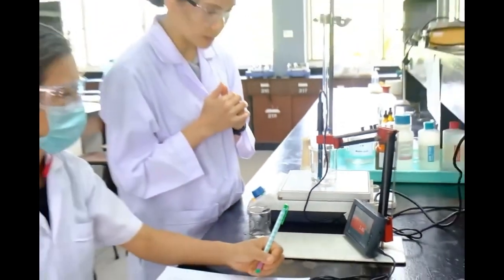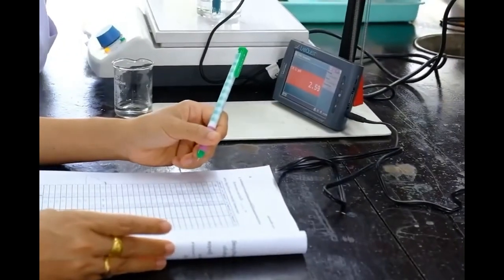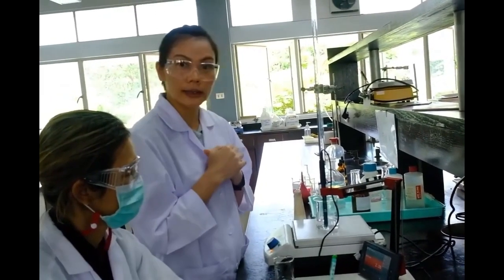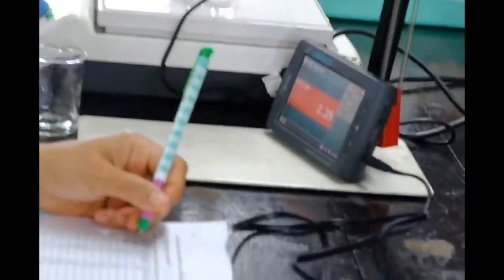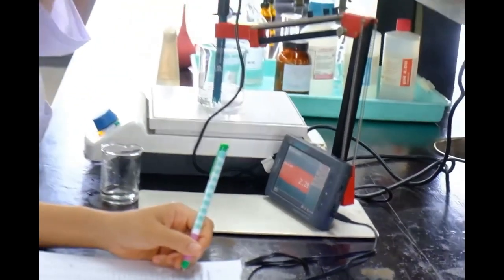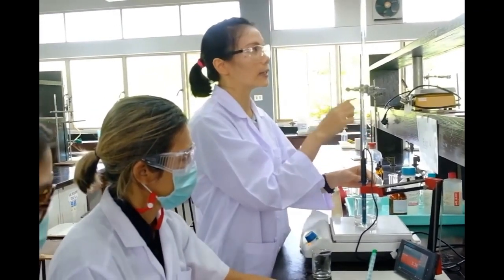Students are to read the pH of the maleic acid solution before adding the sodium hydroxide solution. Now wait for the pH meter to stabilize. After turning on the magnetic stirrer, read the initial pH value before adding the sodium hydroxide solution. Count to 5 seconds and record the reading. After recording the initial volume before adding the sodium hydroxide, proceed to add the sodium hydroxide.